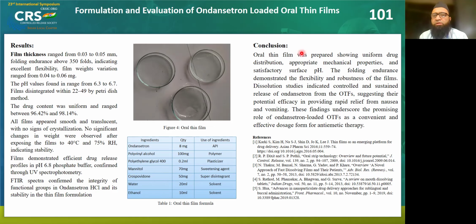In conclusion, we have prepared the oral thin film showing uniform drug distribution, appropriate mechanical properties, satisfactory surface pH, and folding endurance. The dissolution was also performed, and these findings underscore the promising role of ondansetron loaded OTF as a convenient and effective dosage form for antiemetic therapy.